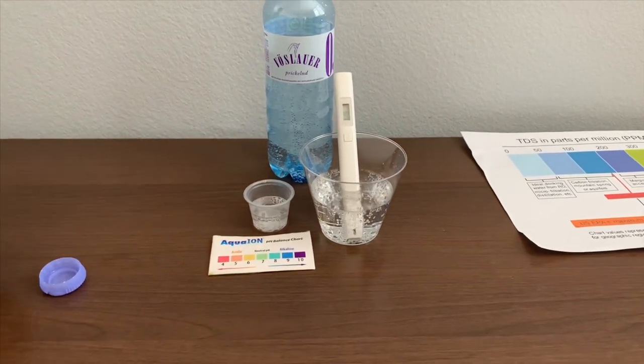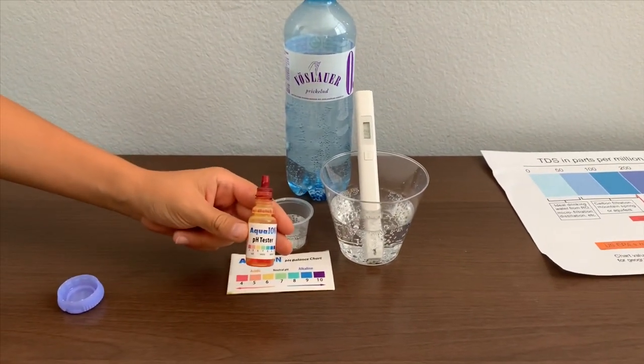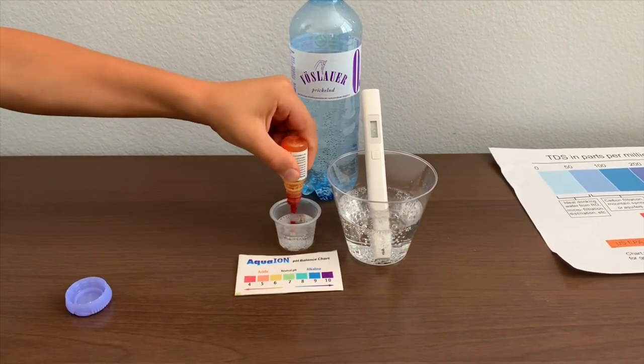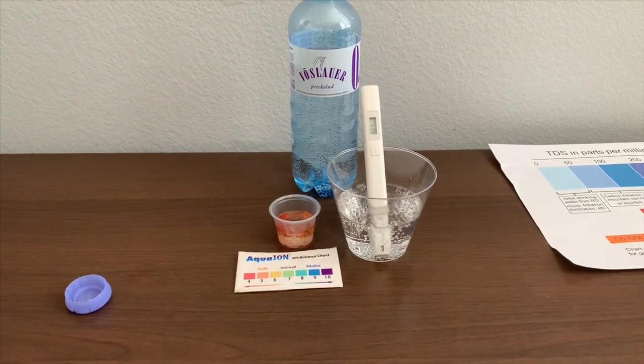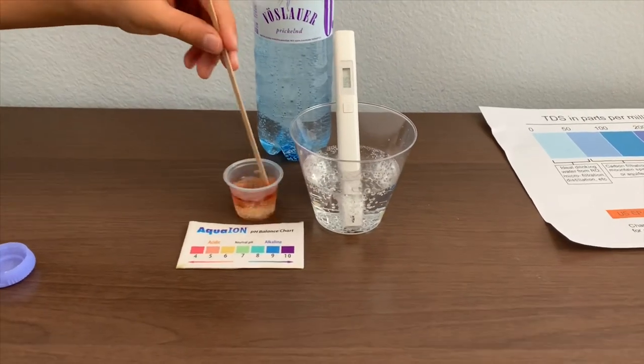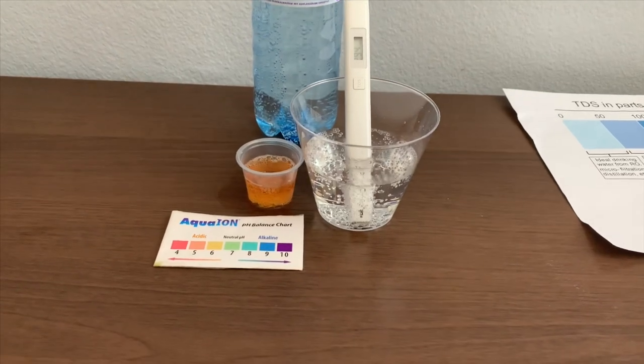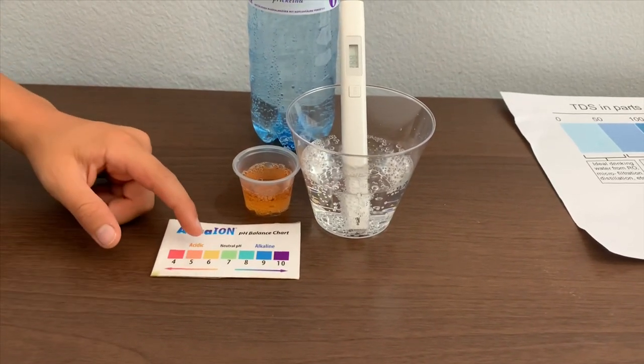Now let's test the pH level. If you want to buy this pH tester, check the link down below. Only do two drops. Let's stir it a little for a better result. I give this a 5.5 — this is acidic.